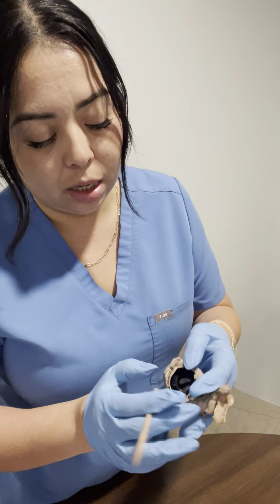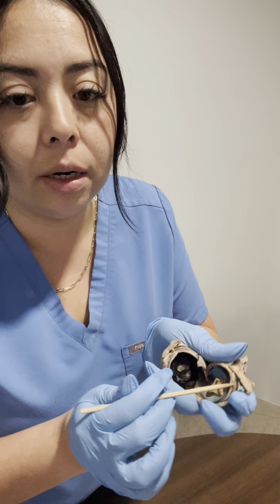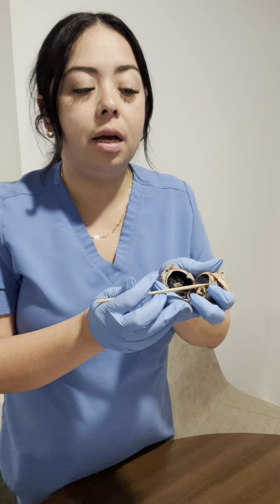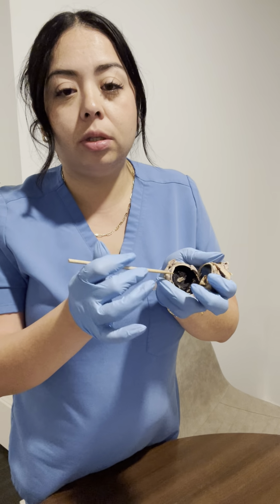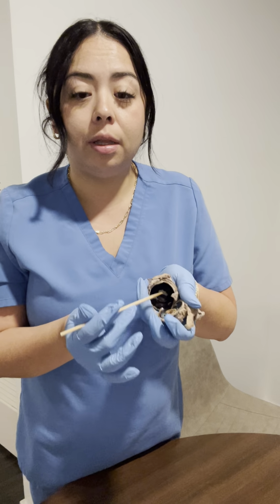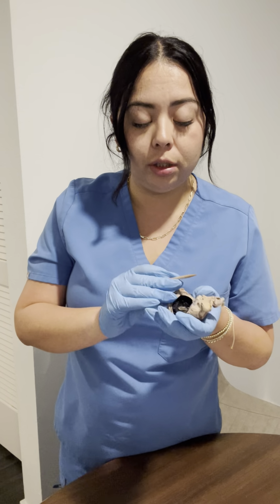I'm going to start naming some of the parts of the eye. So this part here is the sclera, and that helps protect our eye from any injuries or ruptures that may occur. It also helps house, protect, and enclose all the structures of the eye, and it gives support to those structures.